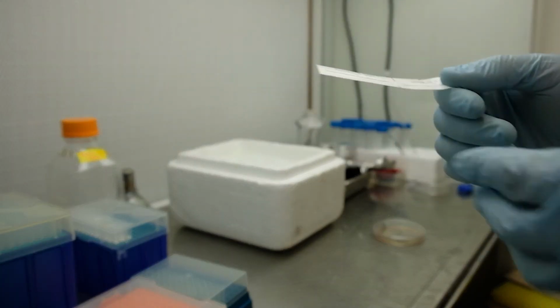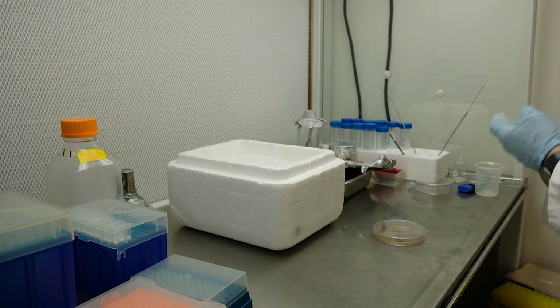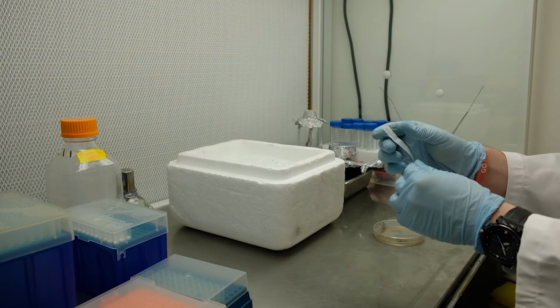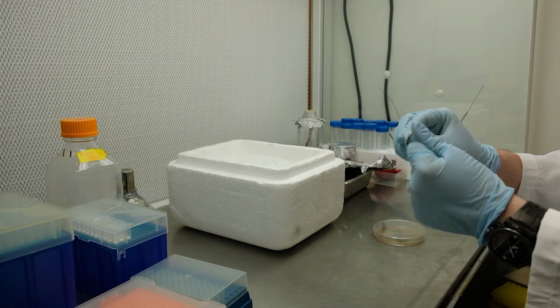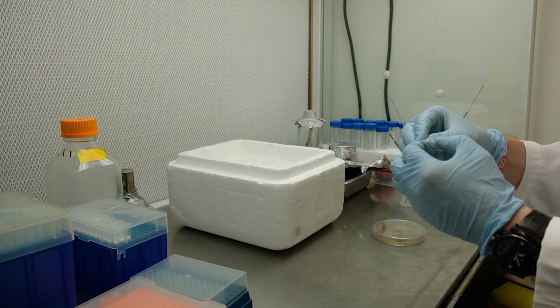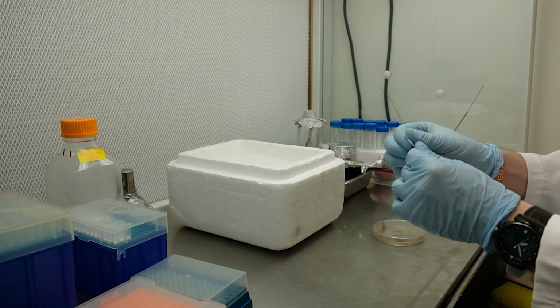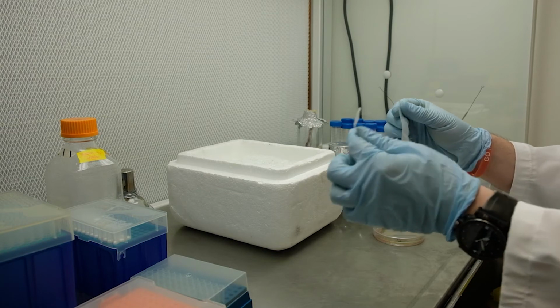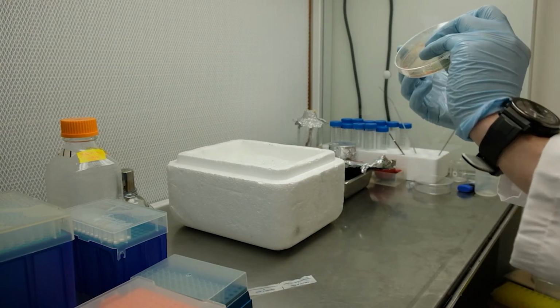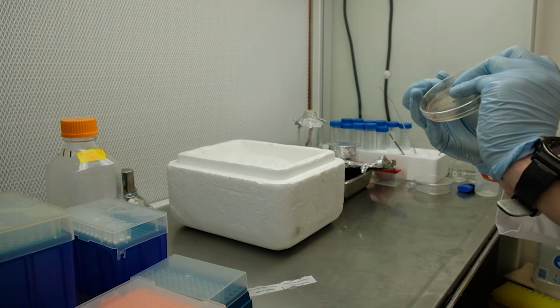The last step is to wrap the edges of your dish with paraffin. Start in one place and go all the way around, trying to make it as airtight as possible.